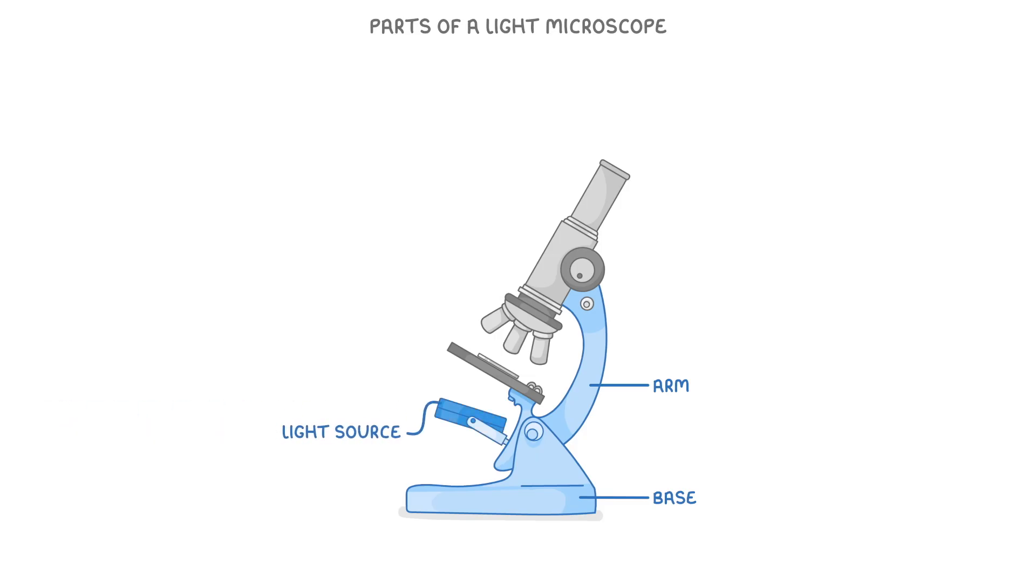Then we have some kind of light source, which on some microscopes would be a lamp but in this case is just a mirror reflecting the light from the room. And just above it is the stage, which is where we put our microscope slide.